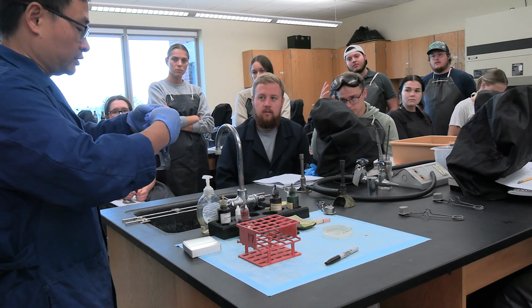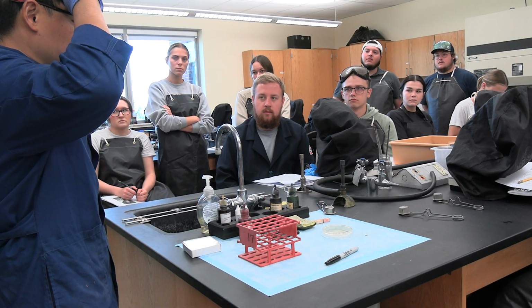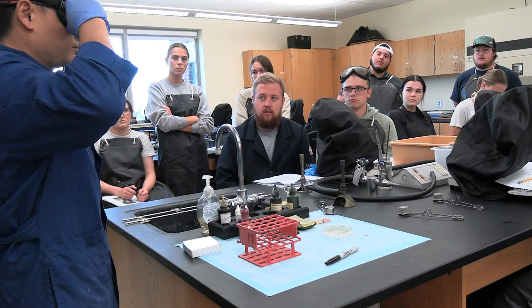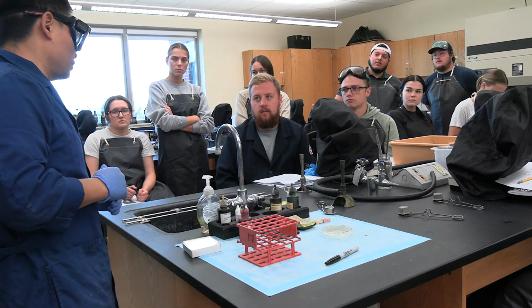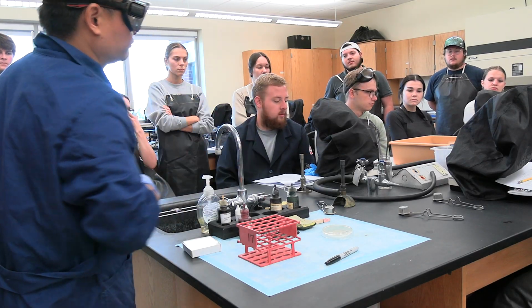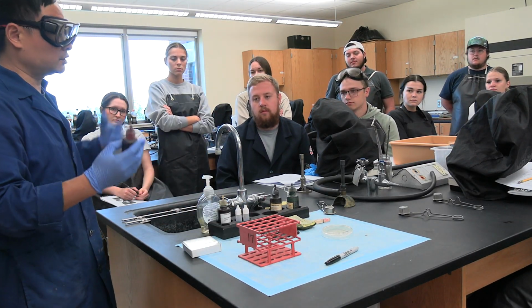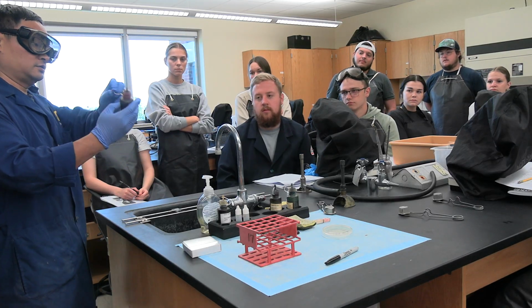It never happened in my lifetime of teaching, 12 years: 2 years in another school and 10 years here. But you still have to be cautious. Wear goggles. The goggles are right in the middle of the box, or you can bring your own. Now we're going to go ahead and do the stain. So I use safranin.